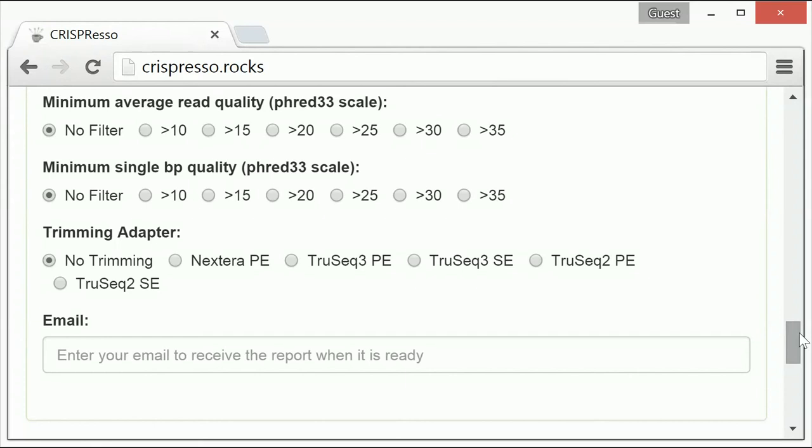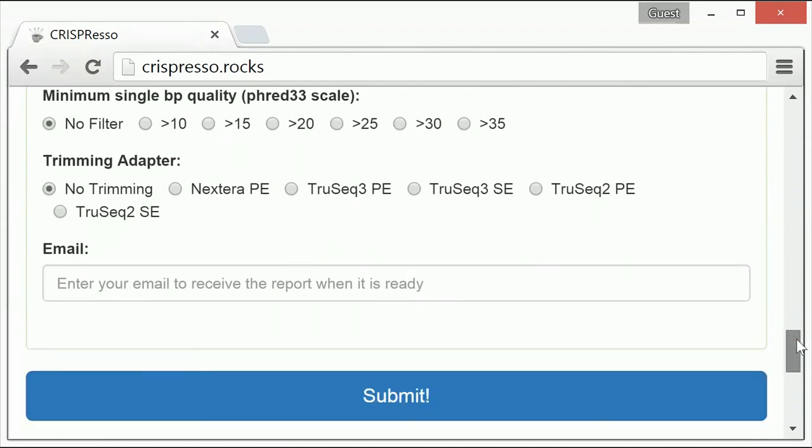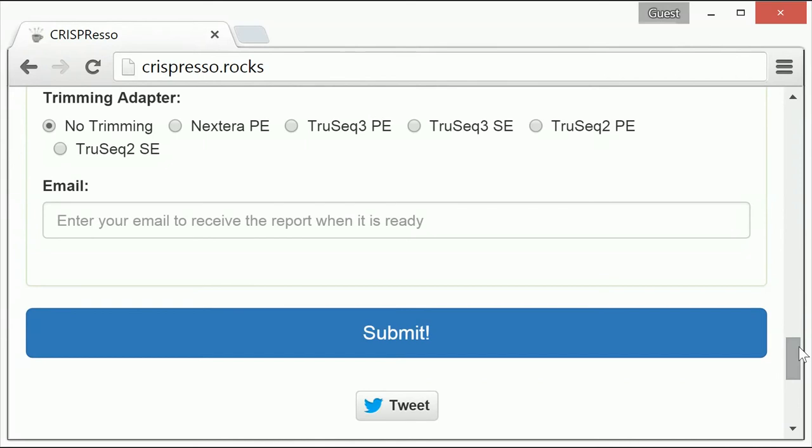The final optional parameter is indicating the adapters used for deep sequencing. If the uploaded data has already had the associated adapters trimmed, then simply select no trimming.